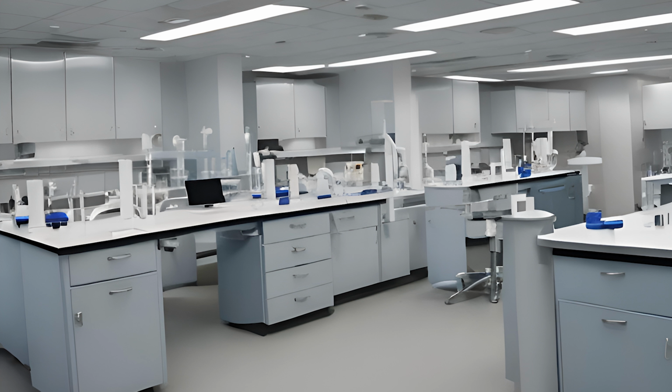This means that even though the world of medical science is very technical and can be highly complex, especially for people who are not familiar with it, when CAP comes to inspect your lab, you are getting inspectors who know what they're doing and they know what they're looking for. These are not people where you just brush something under the rug and they look and say everything looks nice and they walk away. They are going to come into your lab with a book-sized inspection sheet and go down item by item. This inspection can take days or even a week or more, going through hundreds of individual inspectable items for each section of your laboratory.